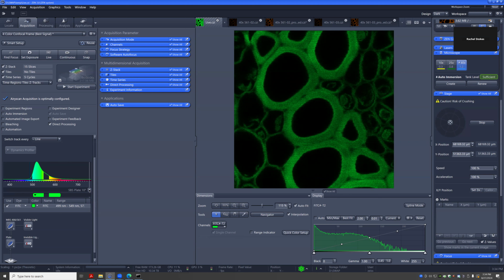And here you could still say, oh, I just want the green. I want to get rid of that red here. So then you could go to the other filter wheel, that SBS wheel, and now even though you use the red-green filter, it cuts away all the red. Now you purely have the green. So combinations here are really, really nice if you want to keep it very narrow. And when you're changing the filters, it will automatically assign the right MBS.